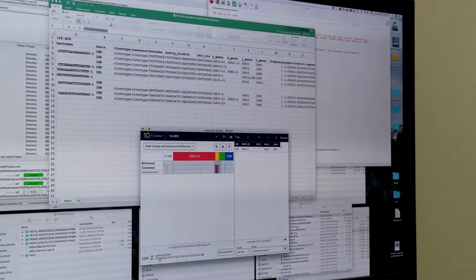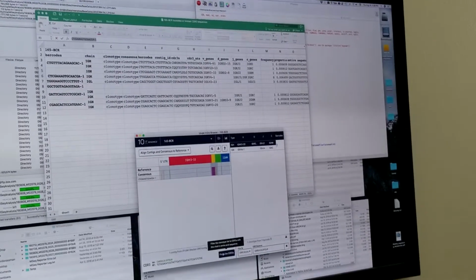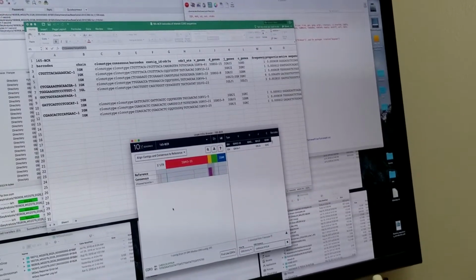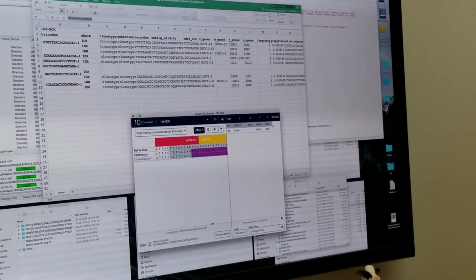Here's the actual nucleotide and amino acid sequence of that. It's the only one out there, of the ones that have been sequenced in your 165 sample, that has that amino acid sequence for the CDR3. Maybe we can look at... I mean, there is a way.